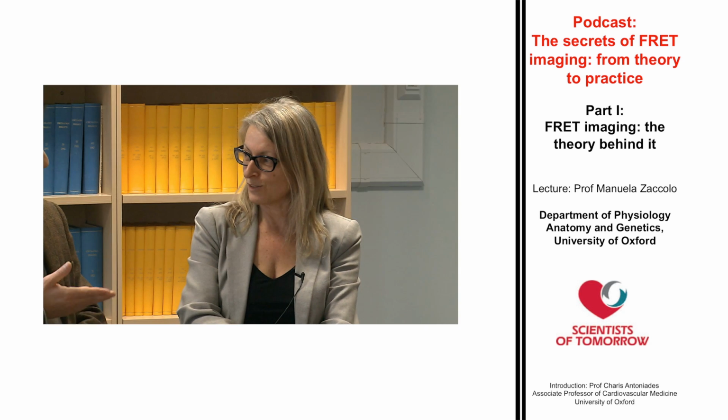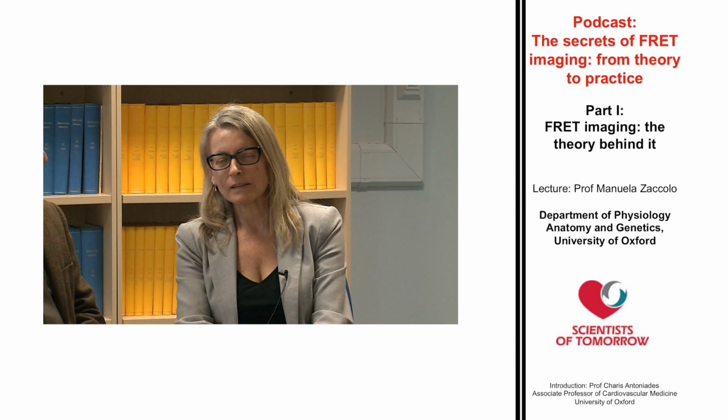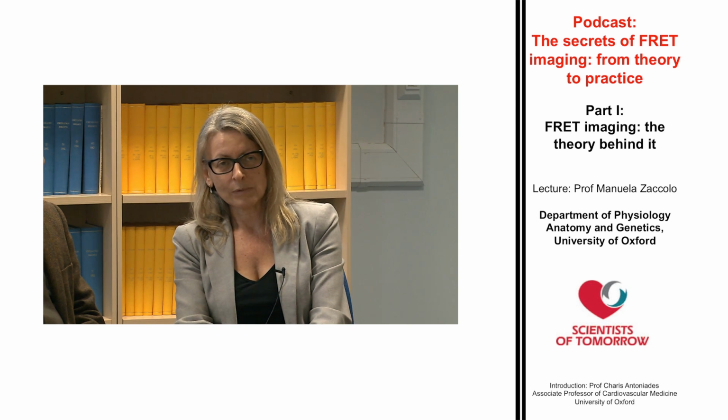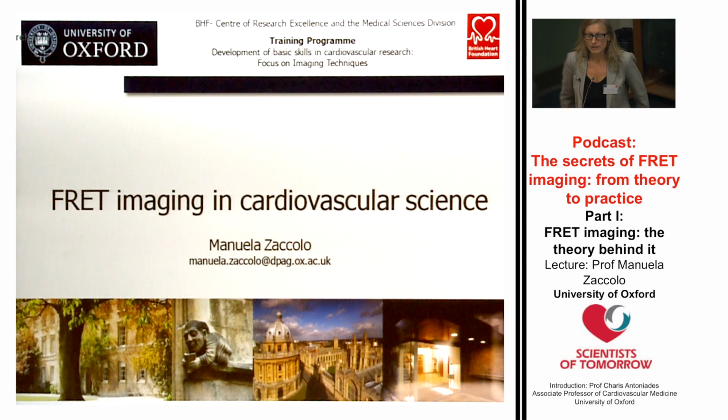Manuela. Thank you, Charis. So this podcast will be composed of two parts. In the first part, I will give you an introduction on the general principle behind FRET imaging and how this technique can be used to study signaling in intact cells. And in the second part, we will go to my lab, and we will film a real FRET experiment.